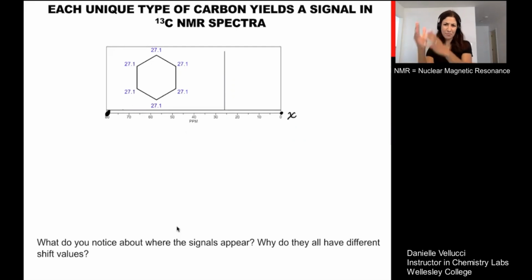You may see the peaks have differing heights, but at this point, those are not going to bear much meaning to us. So really all we are looking for is how many signals do I see within my spectrum? That's the first question we want to ask. So for instance, in the phenol we looked at, we'd expect 4 of these unique lines.